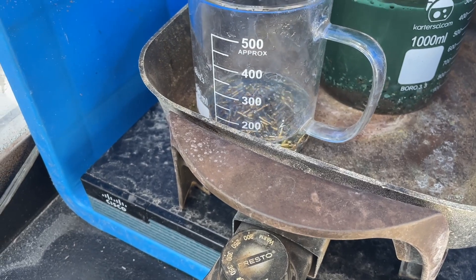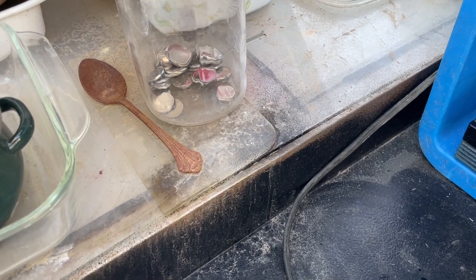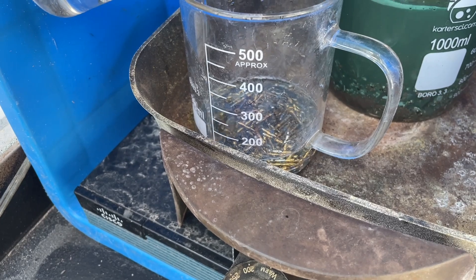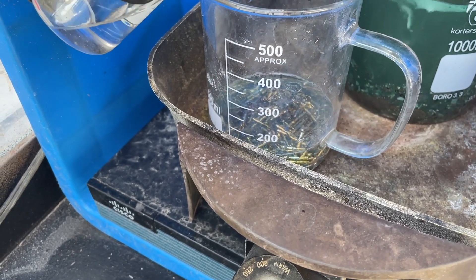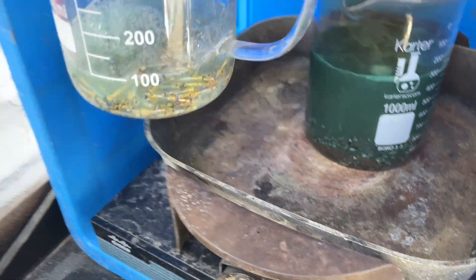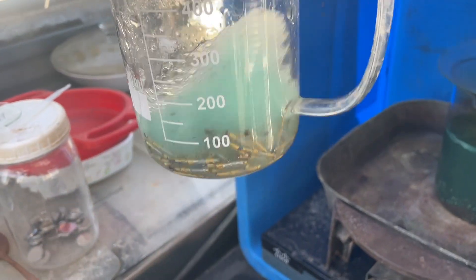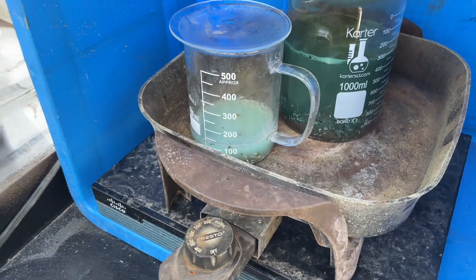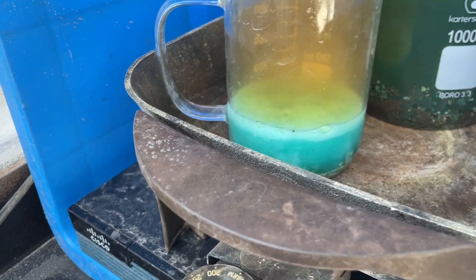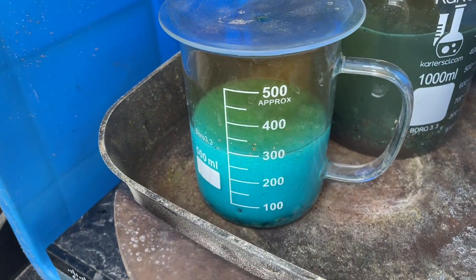I'm going to grab this entire container and put another line in there — that should give us about enough to get it rolling. Yeah, we got about 10 or 12 mL in there. We'll get it heated up and go from there. It's only been a couple minutes — about three minutes — and it's already boiling.